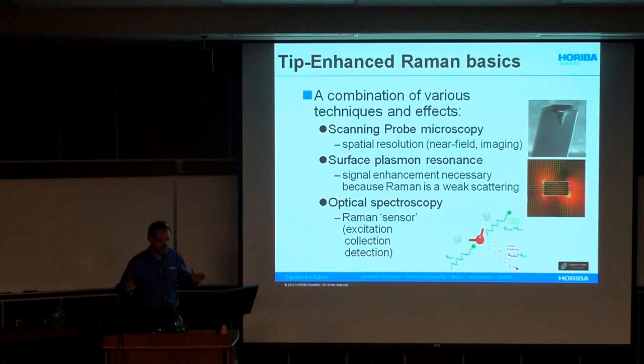So we have a full spectrum at each point, and we generate what we call hyperspectral images, so an image that is built from a spectrum at each data point.